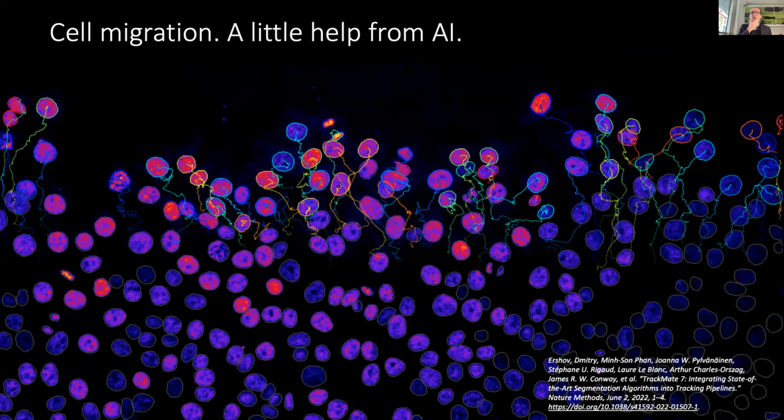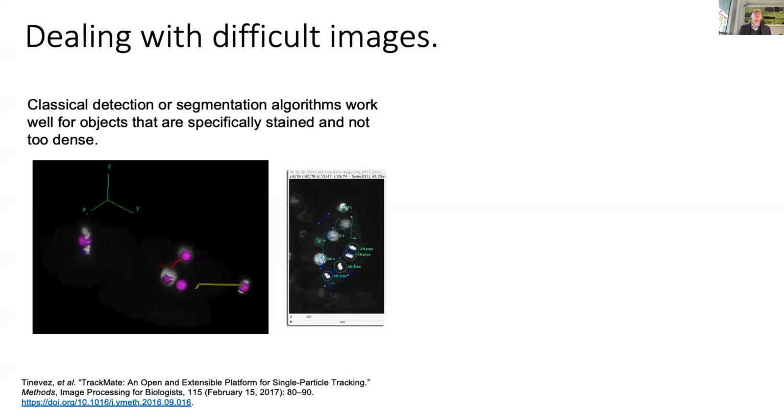The next topic I would like to talk about now focuses on a smaller sample, single cells in the context of cancers. And that's a body of work for which we again developed other tools, but this time focusing on something smaller. And in particular, these are good examples to introduce the importance of artificial intelligence techniques and technologies for our field.